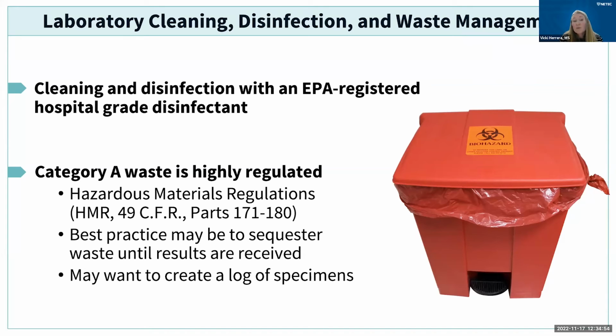And what you use may depend on your facility and what is available. However, be mindful of what you can and cannot use on your instrumentation, as well as the contact time for that specific disinfectant that you're using. Contact times vary based on the disinfectant used.